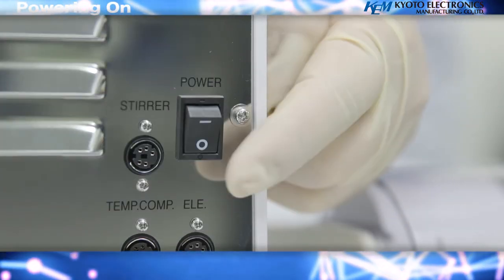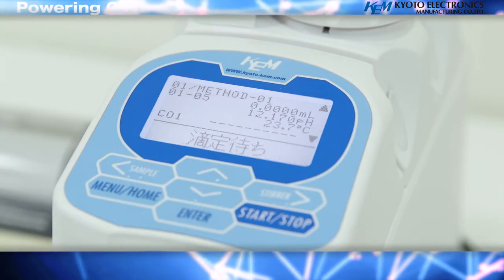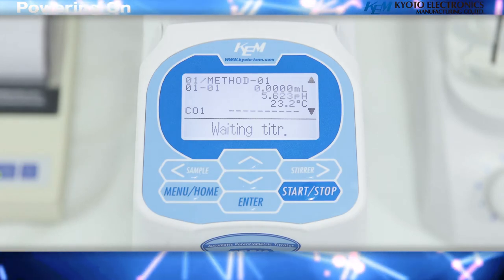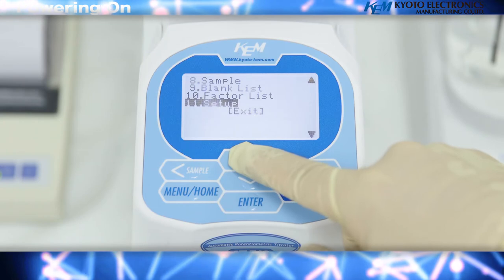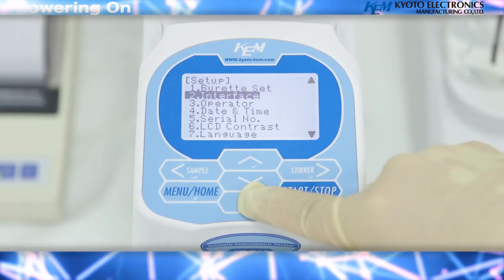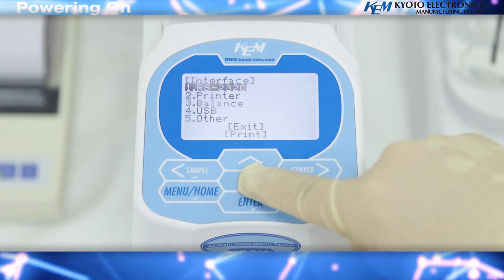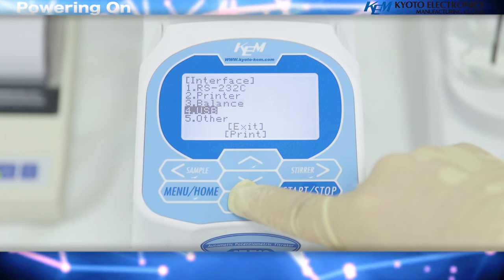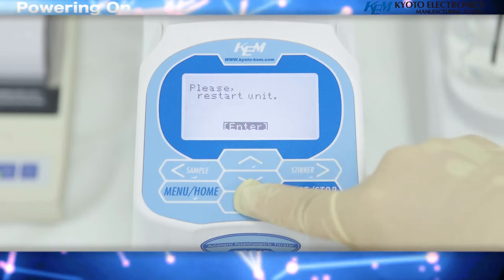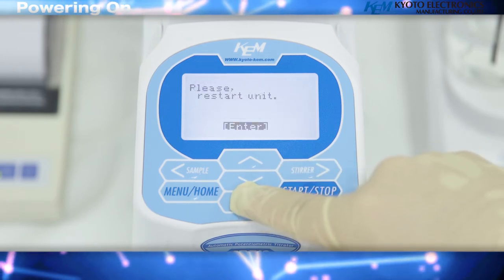Powering on: first, turn on the power to the measurement unit. Then press the Menu/Home key. Select the 11th menu option, Setup, and press Enter. Next, select the second option, Interface, and press Enter. Select the fourth option, USB, and press Enter. Then set the mode option to MCU and press Enter. Turn off the power.